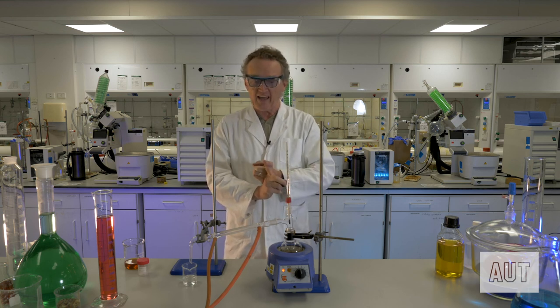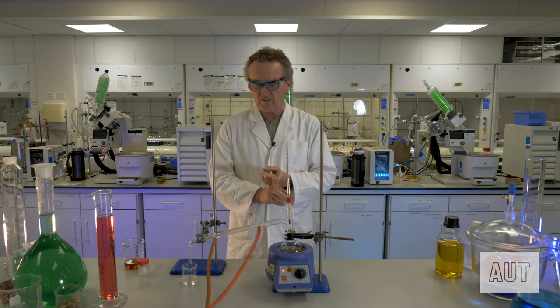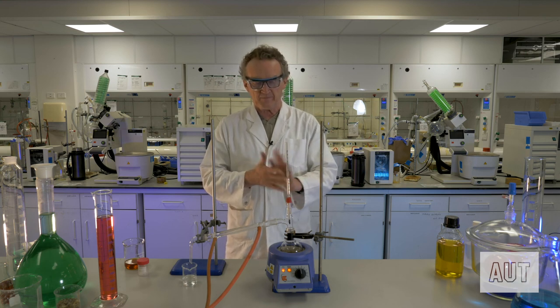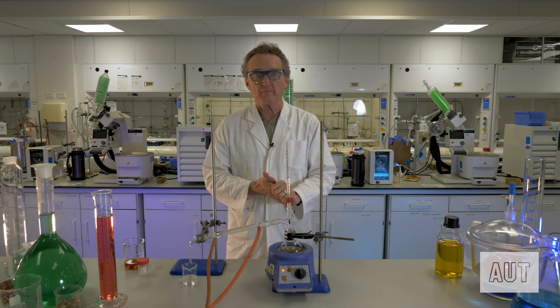So hopefully you've learned a thing or two about, number one, how to set up a distillation, and that can be pretty awkward, getting all the bits in the right place, making sure they're clamped in the right place, making sure you remember to put your anti-bumping granules in, turn on the heater, and you're away.